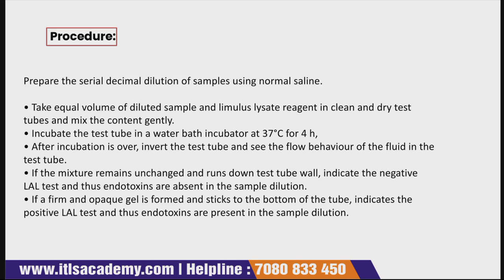Clear? So when it is not sticking to the bottom, it indicates there are no endotoxins, meaning if it is running down the test tube, no endotoxins are present. But if it is sticking to the bottom, it indicates a positive LAL test, and it clearly shows that endotoxins are present in the sample dilution. So this is the procedure.